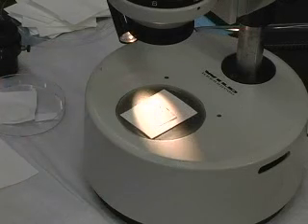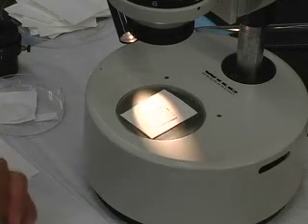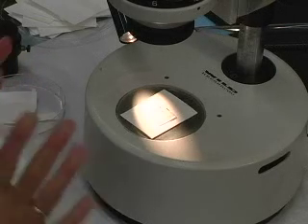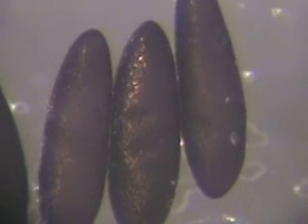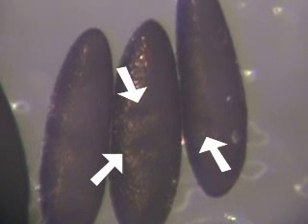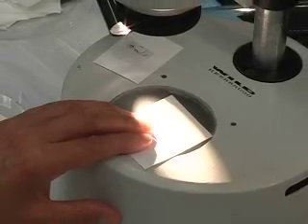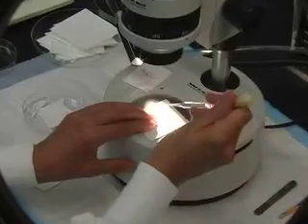Right now is the desiccation step. You have to wait in this position about one minute, but you have to look by microscope and you can see the embryos start to shrink. The embryos are desiccated — you can see the dimples — and when you see the dimples you have to put oil immediately and stop the desiccation. When embryos are desiccated you have to put oil immediately.